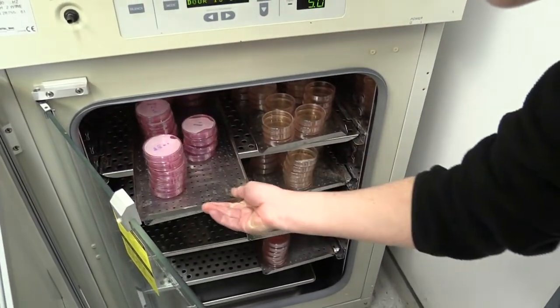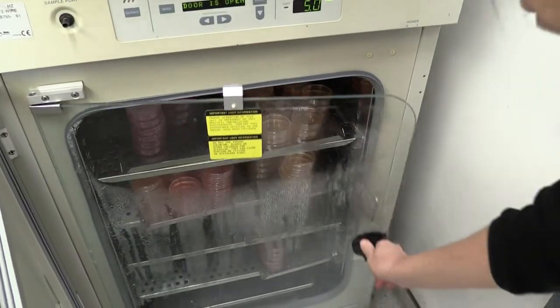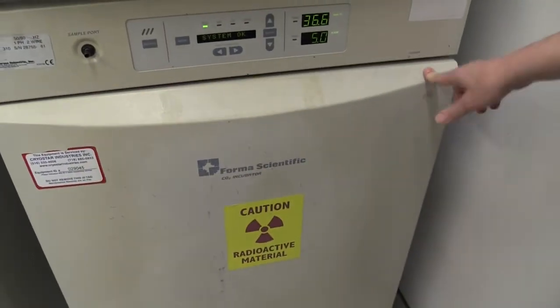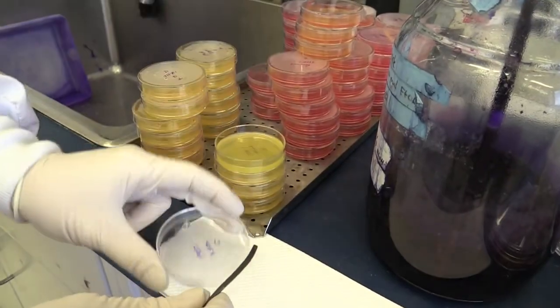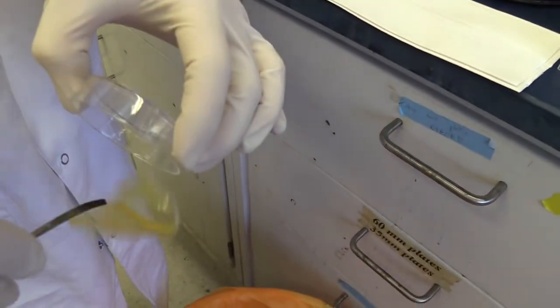This incubator contains 5% carbon dioxide, which acts to maintain the pH of the cell culture medium, which contains a carbonate buffer. After the correct incubation period, we remove the plates from the incubator and we add a solution of trichloroacetic acid to the plates to fix the cells to the plastic. This makes sure they don't come off in the next step when we remove the agar overlay.